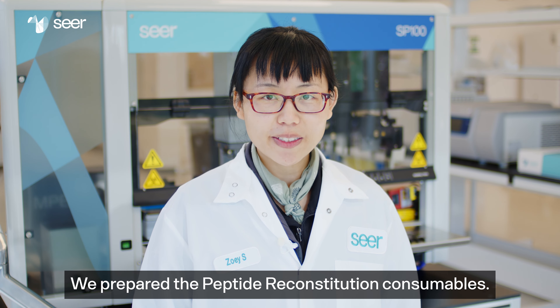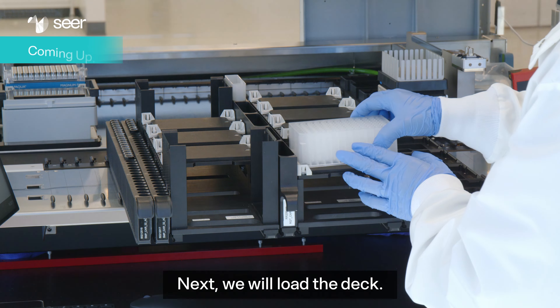We prepared the peptide reconstitution consumables. Next, we will load the deck.